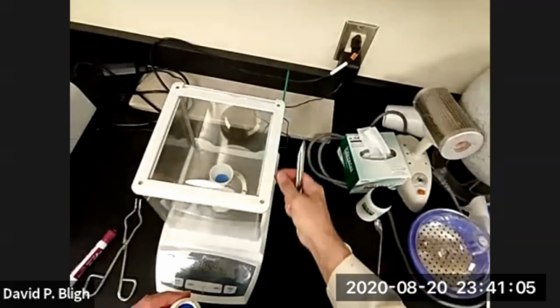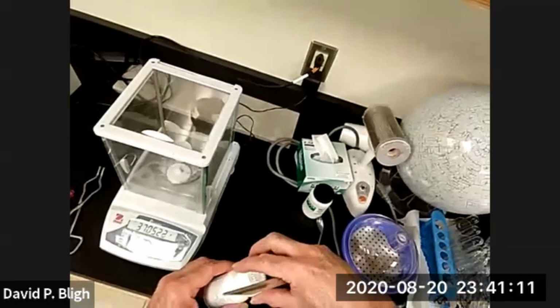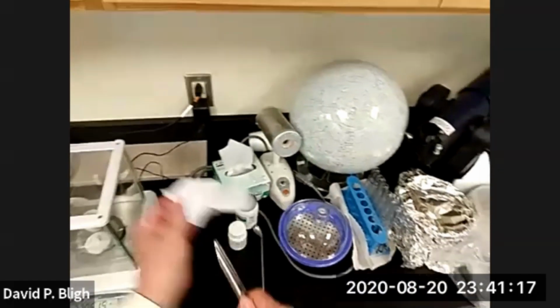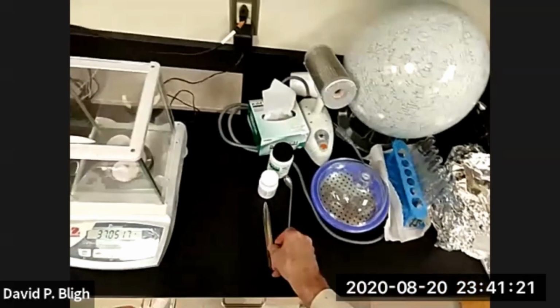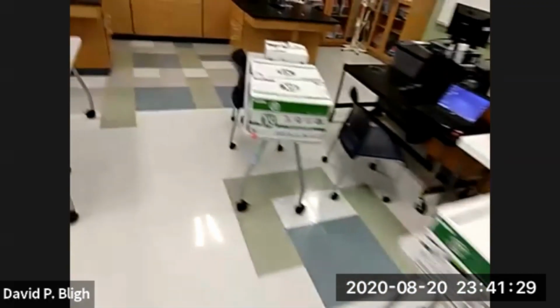All right. Now, close the door because these balances are very sensitive to air movement. So to get your weight, the door needs to be closed. I'm going to clean off my spatula so I don't cross-contaminate. All right, 37.0518.